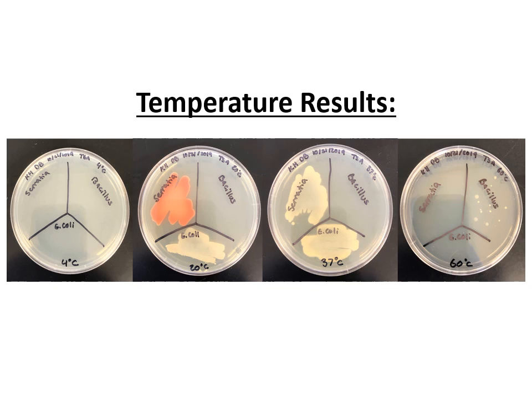So now I'm going to give you a series of actual results, and some of these are courtesy of my former student David, who had taken beautiful pictures of results week to week. So the first set of pictures, these would be your temperature results that I'm going to have you analyze in the post-lab assignment. On these temperature plates, each plate will tell you what temperature it was incubated at, either 4 degrees Celsius, 20 degrees Celsius, 37 degrees Celsius, or the high temperature of 60 degrees Celsius.